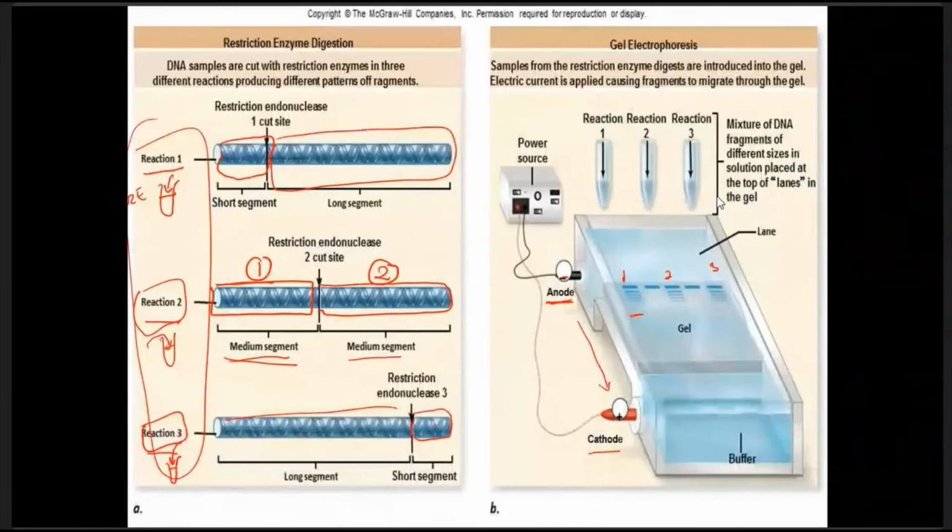Okay, so this is the video to explain how gel electrophoresis works.